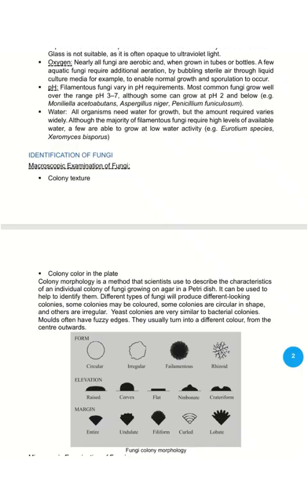When we say macroscopic, that means by the naked eye, you can see the shape, the color, the elevation, the margins of the colonies on the petri dish.